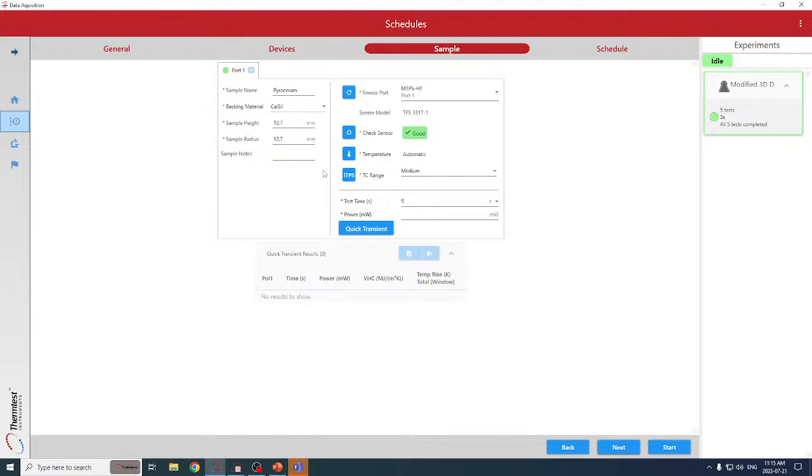So when the heat hits the edge of the sample, there's a reflectance effect, and the software looks for that through that continuous measurement and calculation, and it determines a test time and power based off of that continuous measurement once it finds the boundaries. Because once it finds the boundaries, it knows the time of measurement to find that boundary. And that's a really intelligent approach to making the measurements and using the accurate parameters, but also with the understanding that you can do it manually.